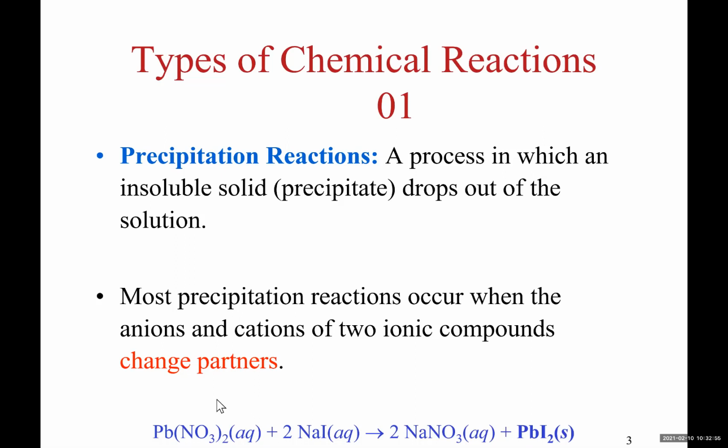You might notice that in showing these reactions, I show the phase of the reactants and products. For example, lead nitrate, which is totally water soluble, made a clear solution. We call it aqueous, soluble in water. Sodium iodide is soluble in water. It makes a clear solution.